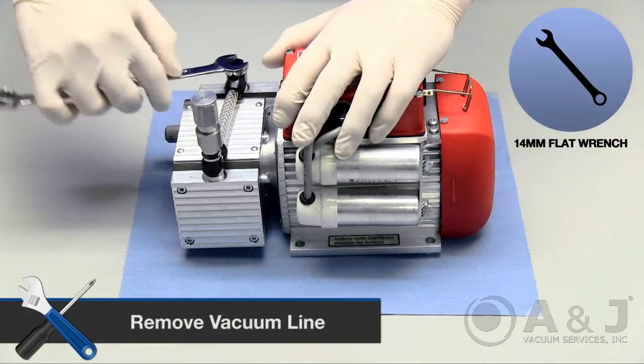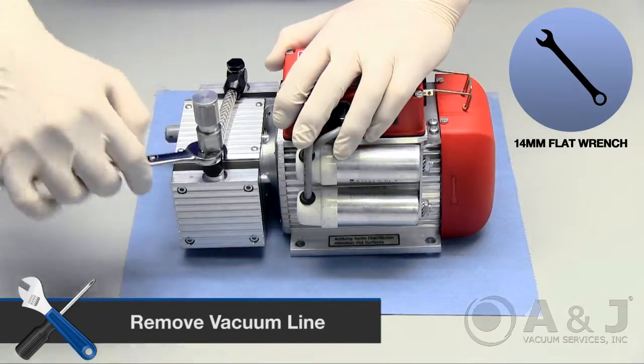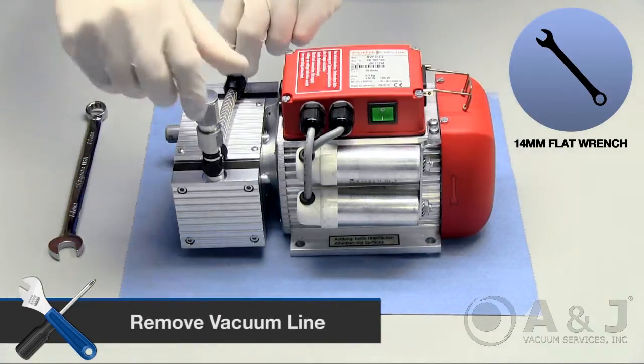First, start by removing the vacuum line on top of the head and loosen bolts with a 14mm flat wrench, then unscrew by hand and put off to the side.